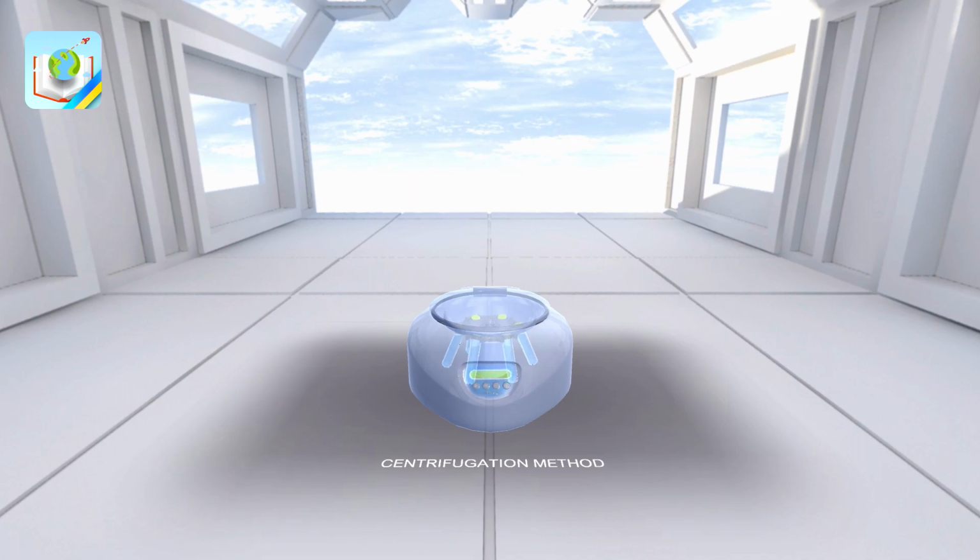Since the test tubes are located at an angle, the liquid in them begins to separate the constituent cells into heavier and lighter ones under the action of centrifugal forces. The resulting force presses on the bottom as denser particles sink to it.